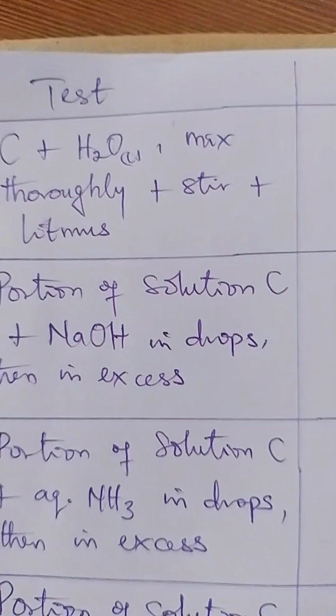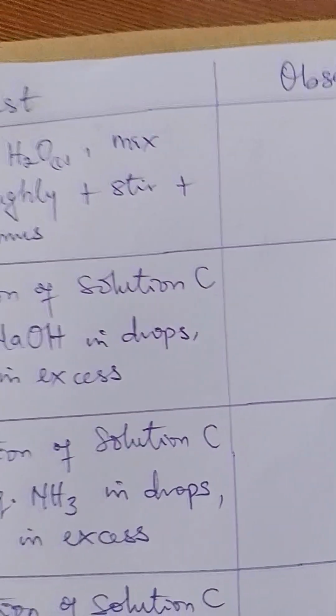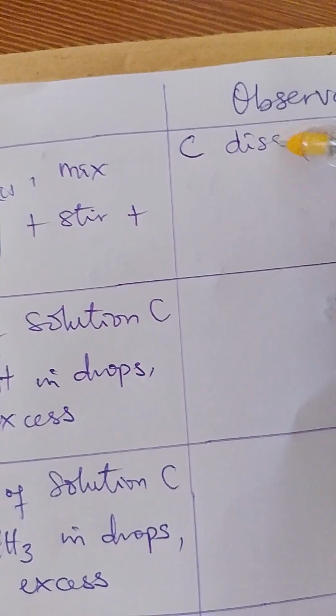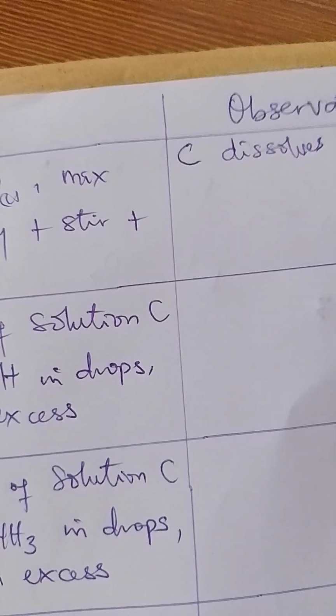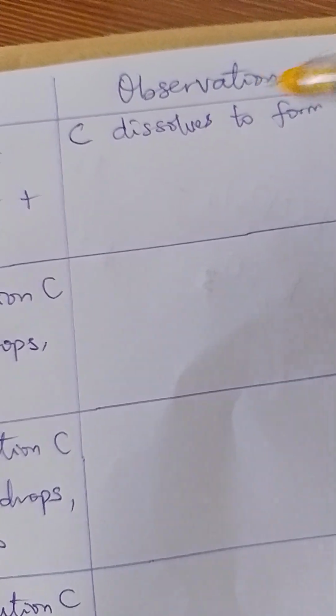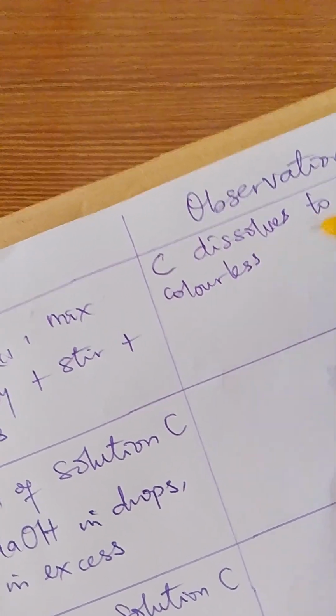If you do that, from what I observed, you are going to see that sample C dissolves. You are going to write: C dissolves to form a colorless solution.